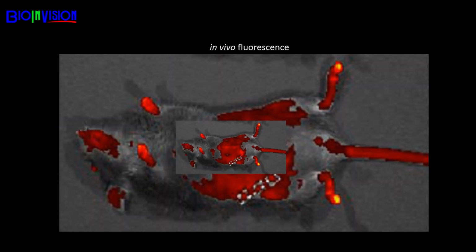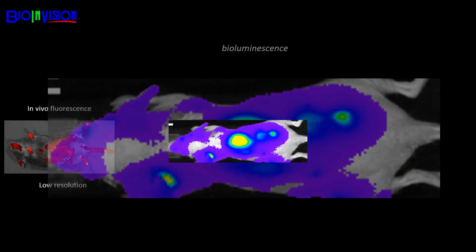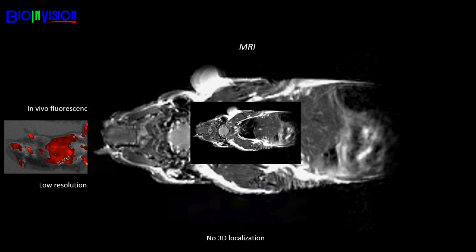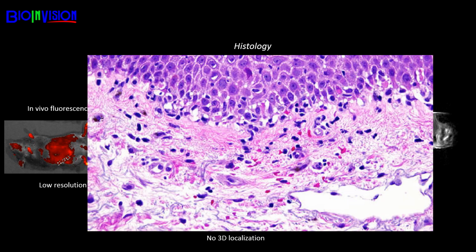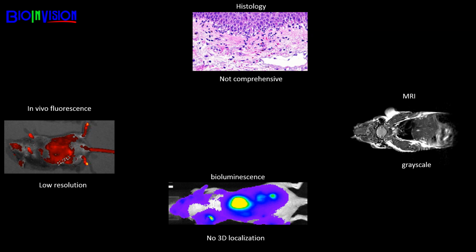You may already be familiar with imaging technologies employed over the past several decades. This includes fluorescent imaging, bioluminescence, MRI, histology, CT, ultrasound, and others. Each has its place, and each comes with limitations as well.